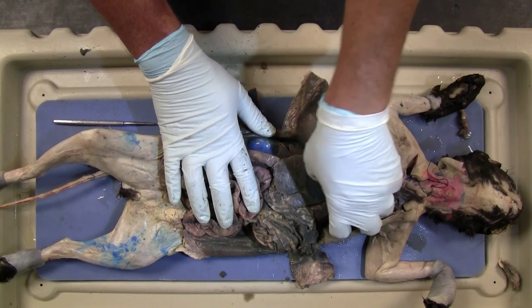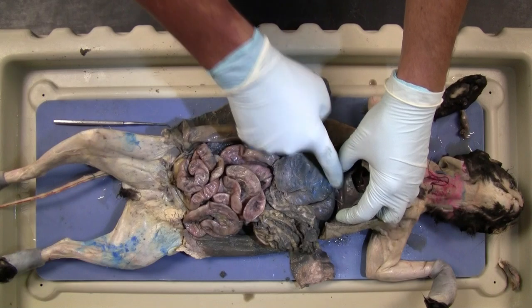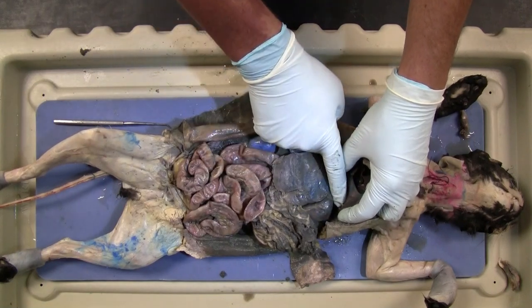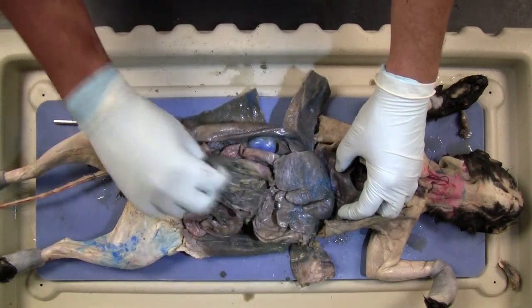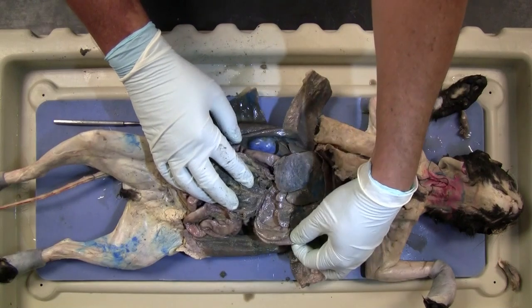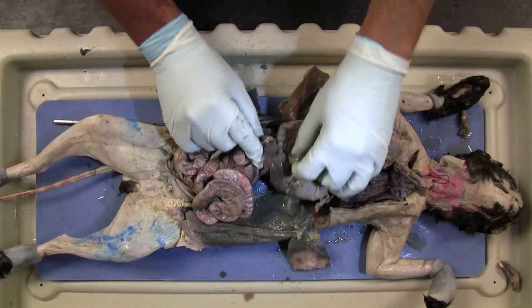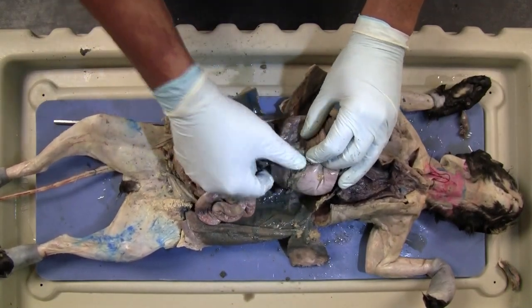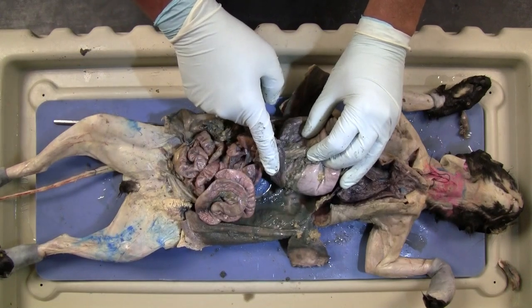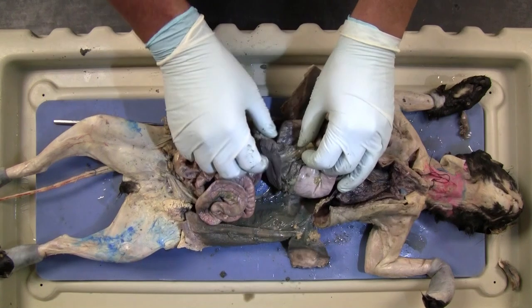So first ligament, you pull up the diaphragm, liver. This ligament right here, that's right above my finger, is your falciform ligament. The next one we're going to look at is we're going to look for the stomach, pull the stomach up, and find the spleen. Here's your spleen. The ligament between your spleen and your stomach is your gastrosplenic ligament.